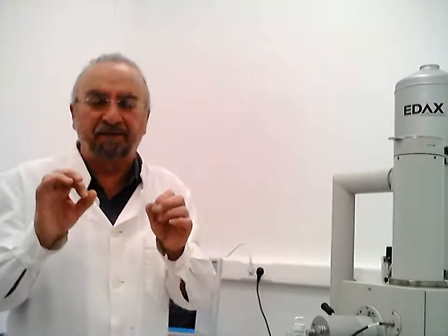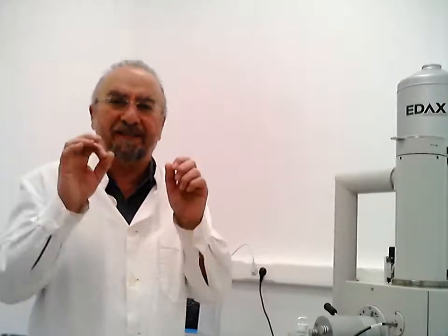Electrons are tiny particles, and the wavelength they correspond to is very, very small. So the result is that we have a very high resolution. First of all, we can see very high resolution, and secondly, depth of field. We can see almost three-dimensional pictures.